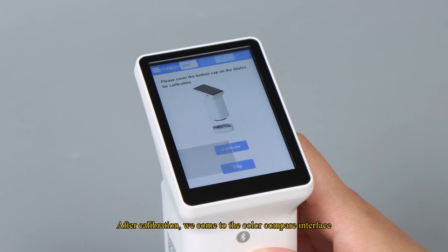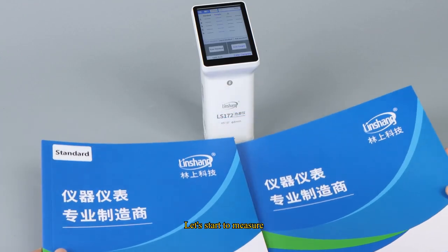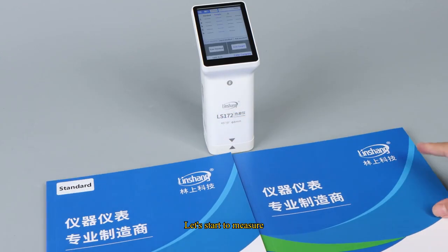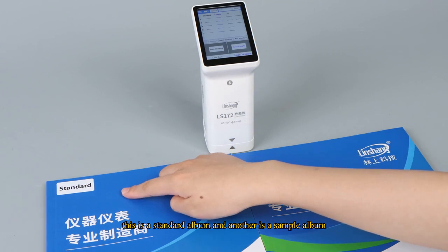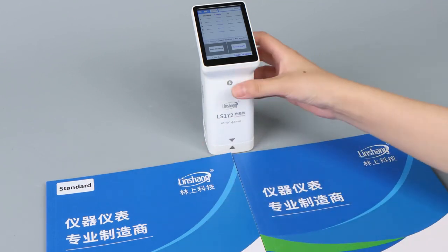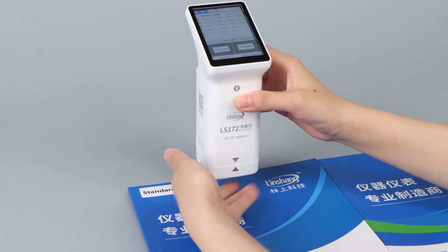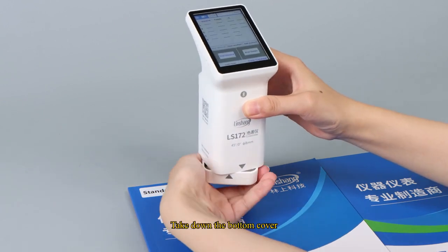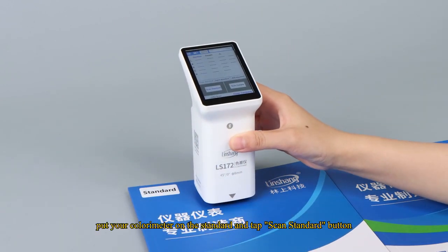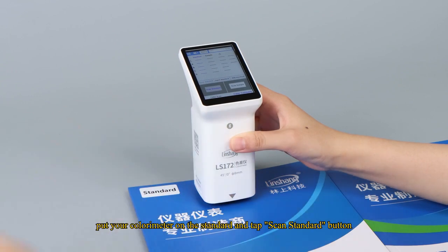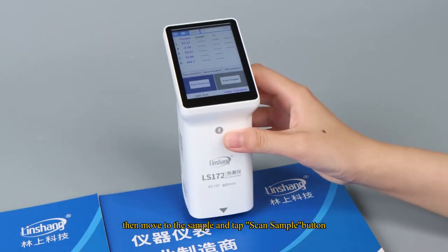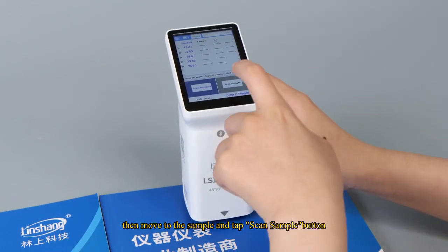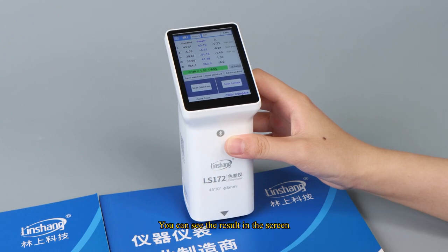After calibration, we come to the color compare interface. Let's start to measure. This is a standard album and another is a sample album. Take down the bottom cover. Put your colorimeter on the standard and tap scan standard button. Then move to the sample and tap scan sample button. You can see the result in the screen.